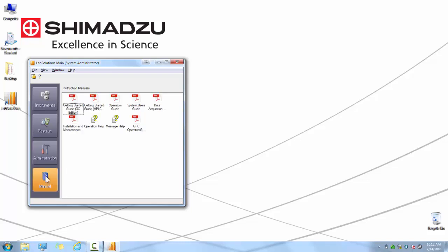The last tab is the Manual tab. This has a library of user manuals regarding your Lab Solutions operation, from your basic Getting Started Guide, to Data Acquisition and Processing Theory, to Installation and Maintenance. We highly recommend you take time to read through these manuals to get fully informed on all of the features and functionality within Lab Solutions software.